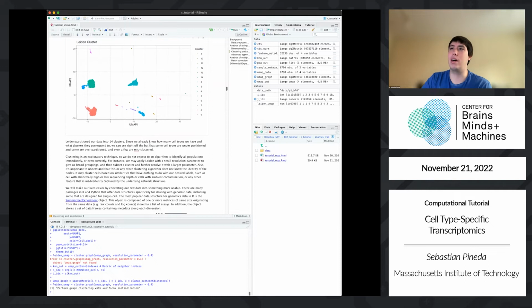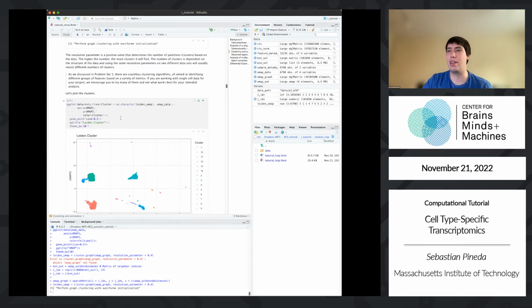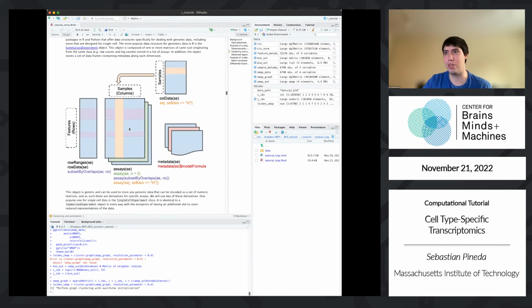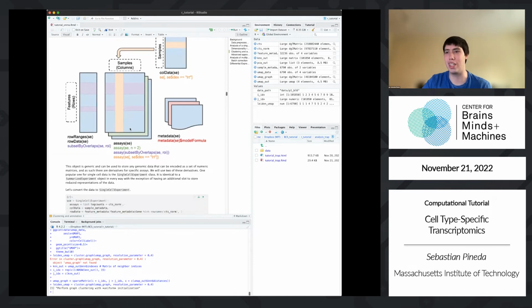And we'll come back to this and talk about more advanced ways of doing this. But right now we've just been playing around with the raw data. We're handing matrices and tables to all these algorithms. We can do what we did in the trap case, where there are convenient software packages that you hand all the data to, and they do everything.